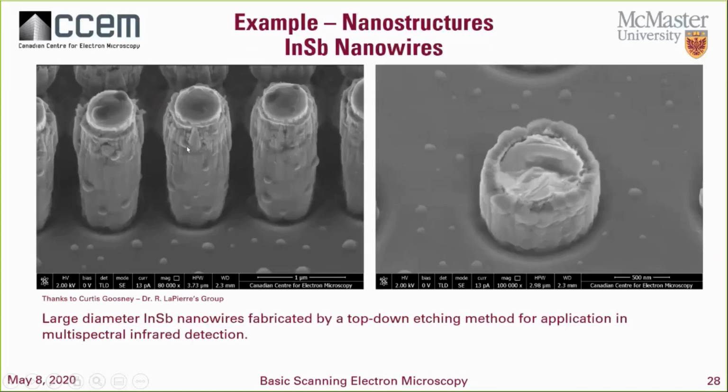Here we can see an example of nanostructures. So here we're doing some tilting, so we can do some dynamic focus control to extend the range of focus. We have things tilted so that, if we looked at this top down, you wouldn't get any idea of what's happening with the structure. So tilting is quite useful. Also, tilting can help us with getting more secondary electron detection. If you're tilting towards the detector, you can get more secondaries for doing imaging.